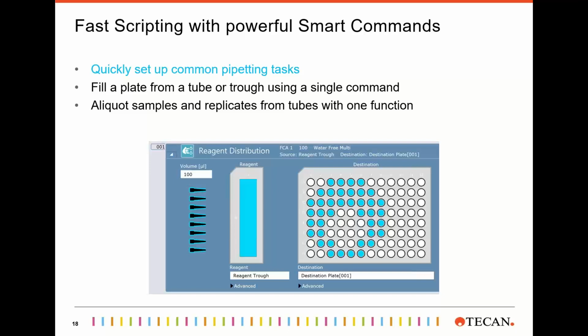And you just have to use only one command, and then you can tell the software about your source plate, your destination plate, the number of replicates, etc. And you don't need to write any loops or think about variables in any way. The software takes care of that all in the background during the run.